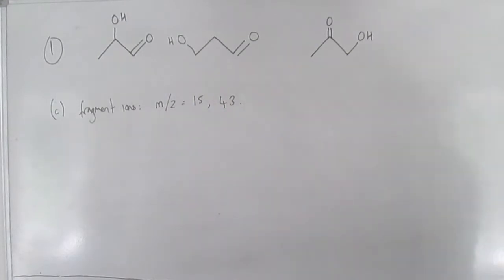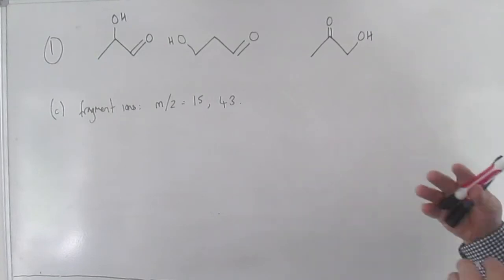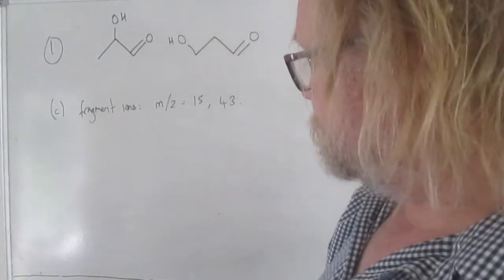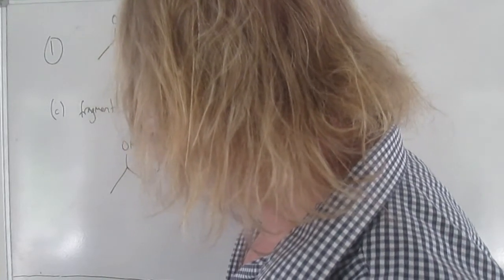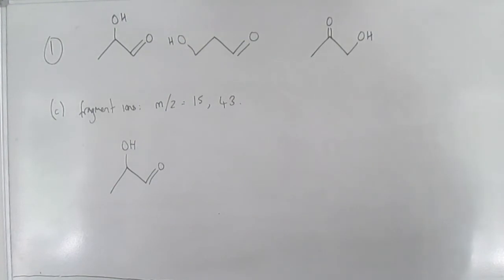Okay, these ones that they picked were the ones with the biggest intensity. That means that they're the best populated fragments, the fragmentations that occur most frequently. And those generally are the only ones you can interpret. The little tiny peaks down at the bottom, don't even go there, because all kinds of things can happen to cause those in the spectrum. So if we start with this one, we can just go through and think, right, how might it fragment, and what would be the masses of the fragment ions you would get?